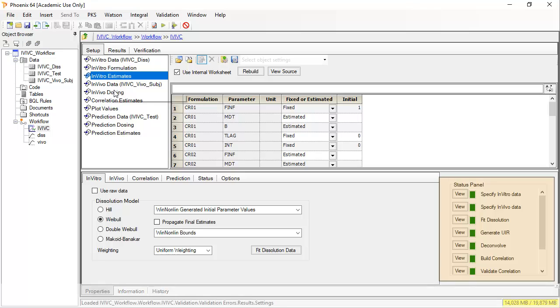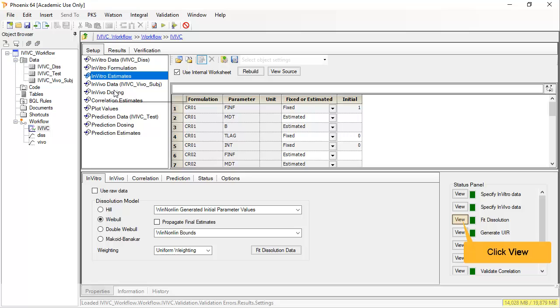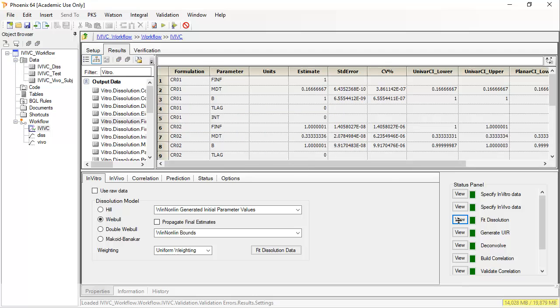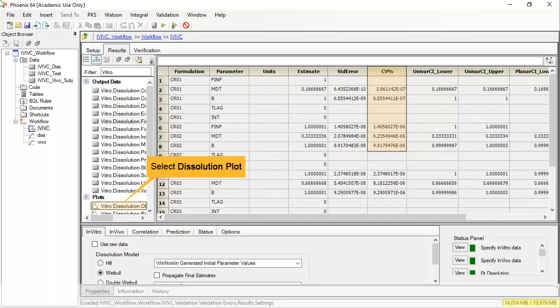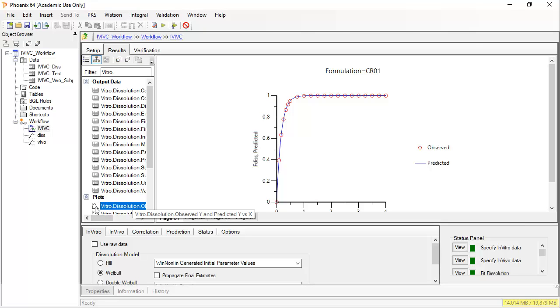On the bottom right, the status panel is very useful to help navigate the output. Clicking on view will take us to the output of fit dissolution. For this data, a Weibull model was deemed best. We can see the parameter estimates have a very low CV percent, indicating we have good confidence in them, and the observed versus predicted fits look good.